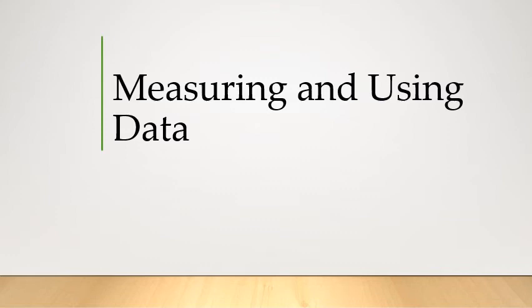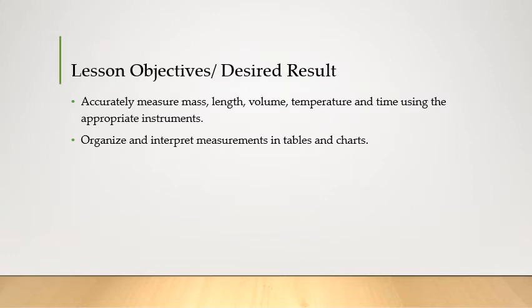In this lesson, we are going to be learning about measuring tools and using data and how to put that data into tables and charts. So our desired result is to learn how to accurately measure mass, length, volume, temperature, and time using the appropriate instruments for the lab, and to be able to organize and interpret measurements in tables and charts.